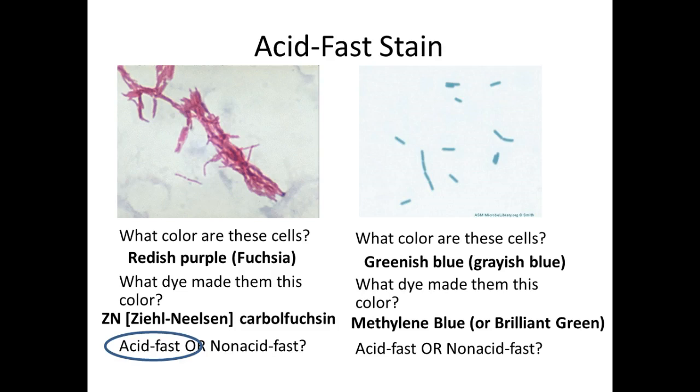And then in the videos, if you watch the videos that I had for you guys, do you guys remember what different counterstain they used? Crystal violet. They used crystal violet. You can use whatever you want as long as you can tell the difference between that and the carbolfuchsin. So I wouldn't suggest using like safranin, right? That may be difficult to determine the difference.